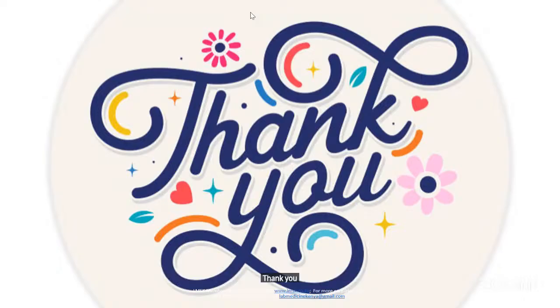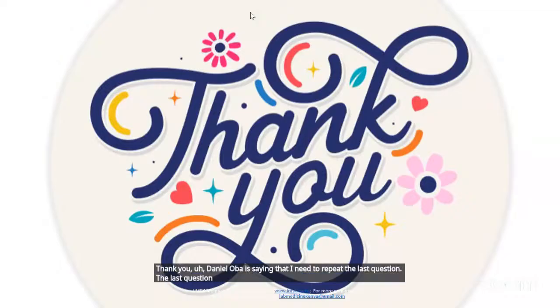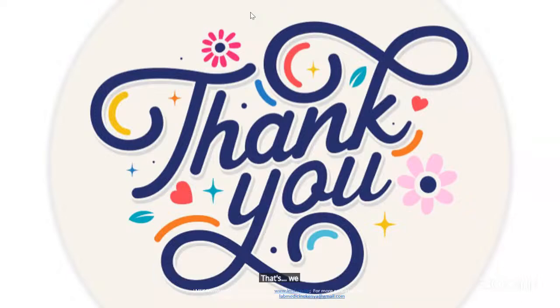Thank you. Ata, back to you. Thank you. Daniel Oboya is saying that I need to repeat the last question. The last question, Daniel Oboya, that we've talked about is from Dorothy Karimi, and the question was, if one does not have formalin, what else can a use to preserve tissue?